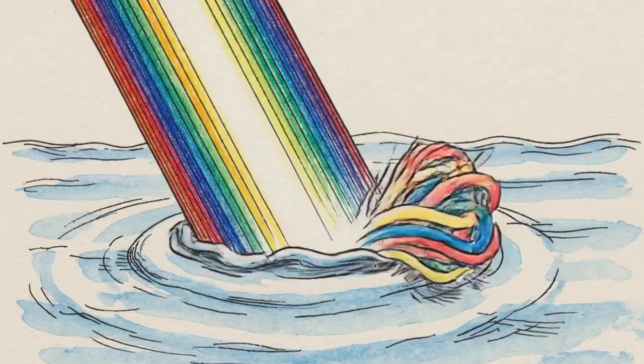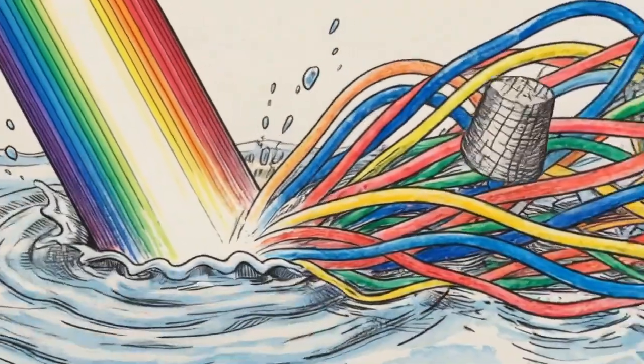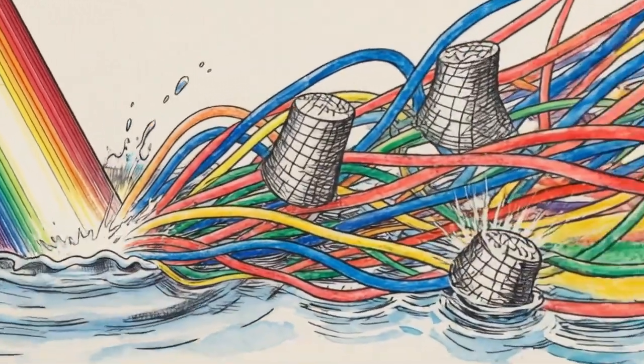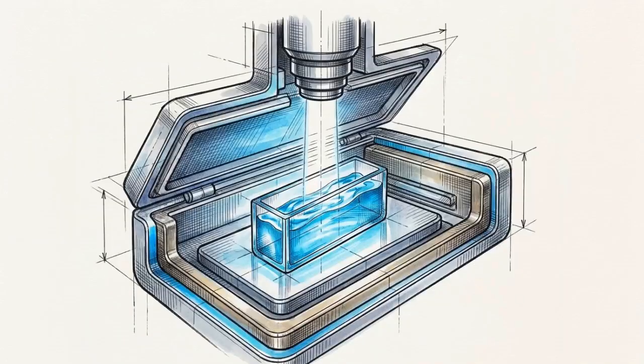When broad-spectrum light strikes a physical medium, the interaction is chaotic. Millions of overlapping wavelengths refract, scatter, and absorb simultaneously. To extract precise chemical data from that interaction, we rely on the Beer-Lambert law. But that mathematical relationship demands absolute optical purity, strictly monochromatic radiation, meaning light of a single exact wavelength.